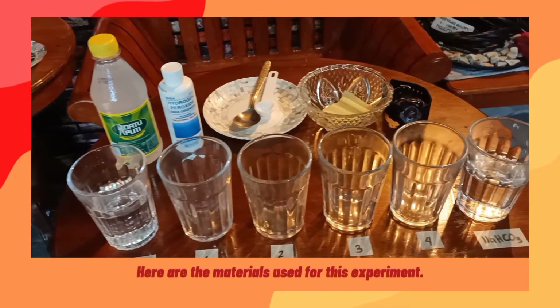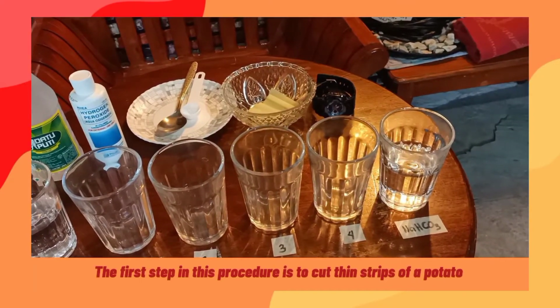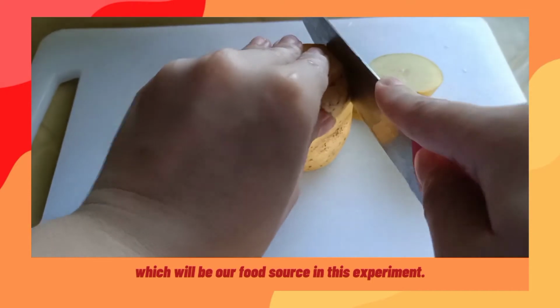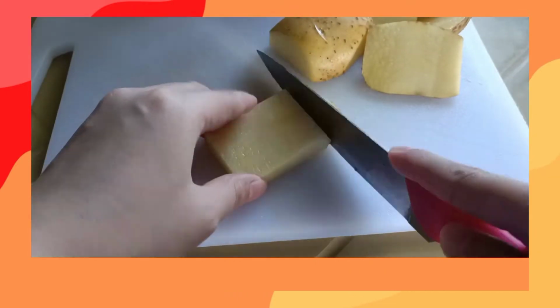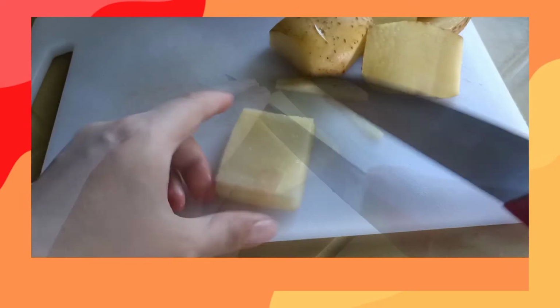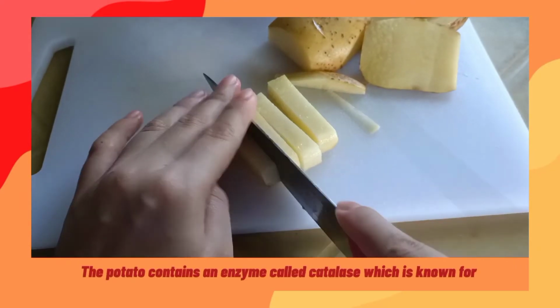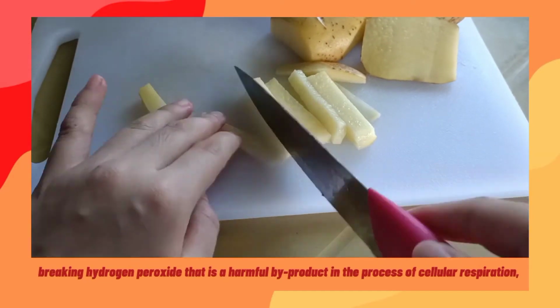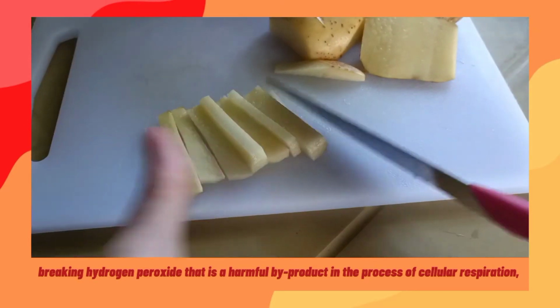Here are the materials used for this experiment. The first step in this procedure is to cut thin strips of a potato, which will be our food source in this experiment. The potato contains an enzyme called catalase, which breaks down hydrogen peroxide, a harmful byproduct in the process of cellular respiration.